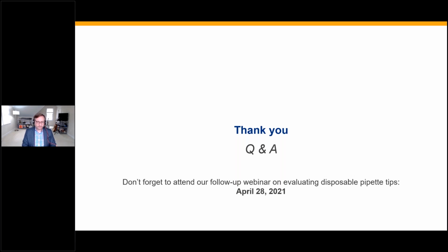Good question. It looks like he has a follow-up saying that the Integra Viaflows apparently quote a tighter tolerance. It's entirely possible. It depends on what you need it for. What I would say is make sure that whatever your measurement tolerance is, it's capable of meeting your assay numbers. The manufacturer's specifications are great, but make sure that it meets your application numbers. That's the most important part.